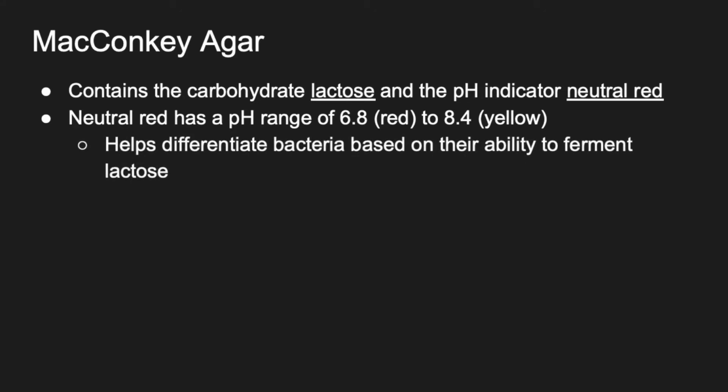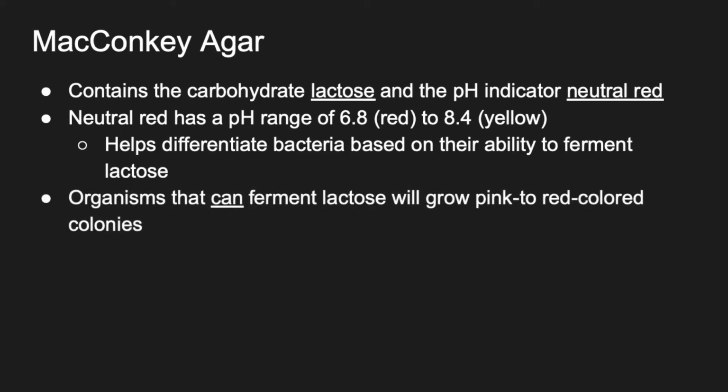And why neutral red is important is that it's in this agar because it helps us differentiate bacteria based on their ability to ferment lactose. So does the bacteria that we plate ferment lactose or not? That's one aspect of MacConkey agar. So can it ferment lactose or not? That is one aspect of MacConkey agar.